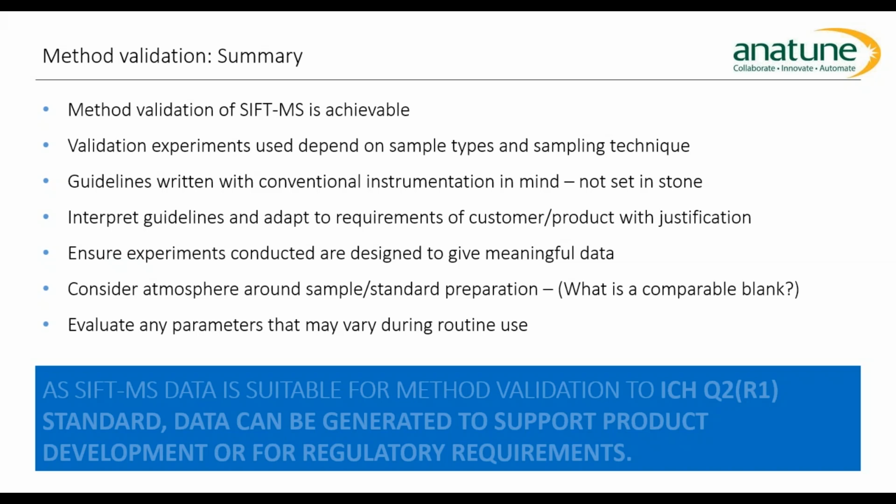But bear in mind, they are guidelines written for conventional instrumentation. They're not set in stone. They guide you through the process of doing a validation. And as long as you can interpret those guidelines and adapt to the requirements of the product or the customer with due justification, it is entirely possible to validate this data.